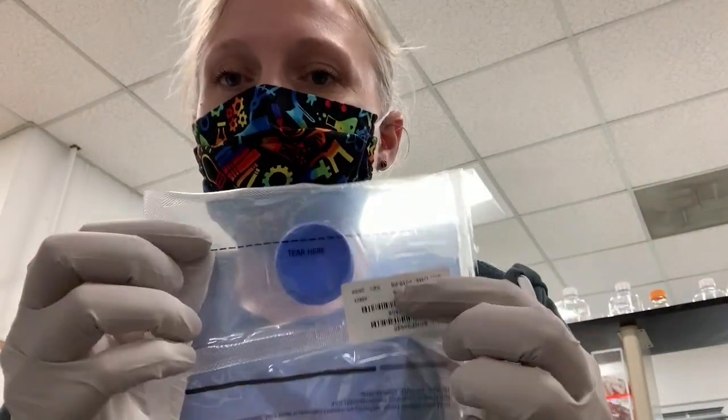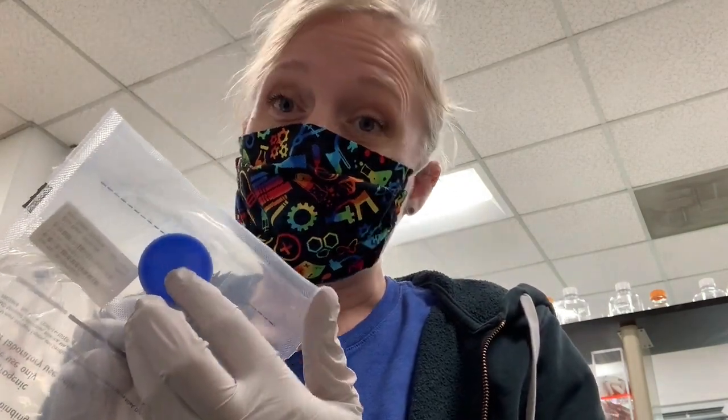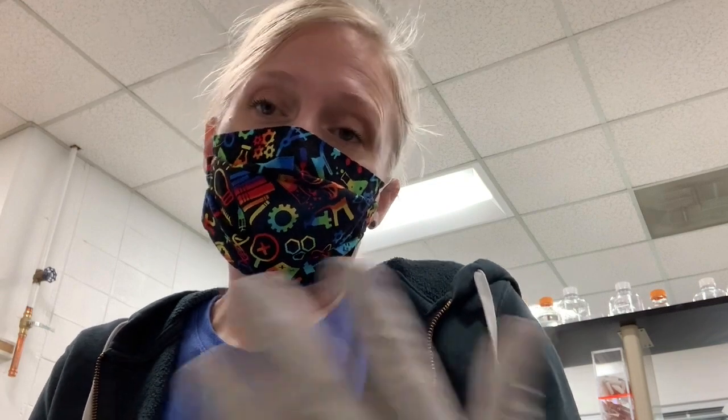Once that liquid is through, you can remove this lid from the package, being careful not to touch the inside of the lid. You want to keep it sterile. That kind of defeats the purpose if you touch it with your hands. So when this finishes, I'm going to turn the vacuum off, remove the tube, and then remove the filter and the top tube and add this lid. You'll notice that then your tube is not labeled because you probably had the other lid labeled. So you need to relabel your tube. And once you have a solution that's been sterile filtered, as long as you follow sterile technique, then that solution should stay sterile for you.